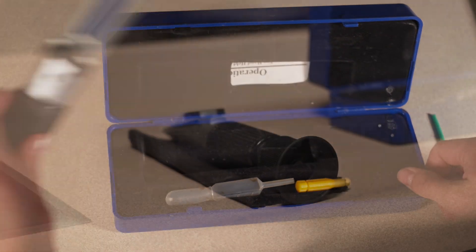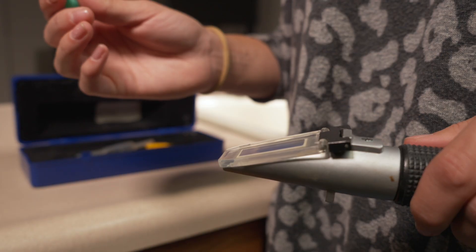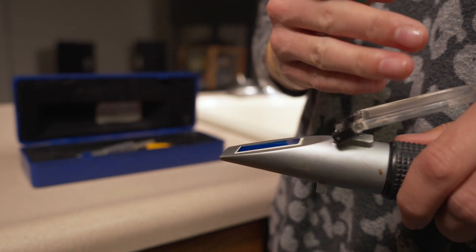However, each refractometer is specifically designed to measure the concentration of a particular item. In other words, refractometers are product specific.